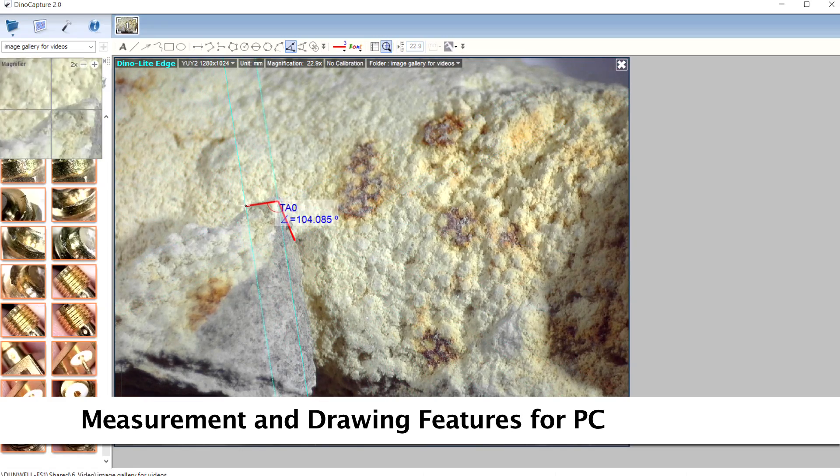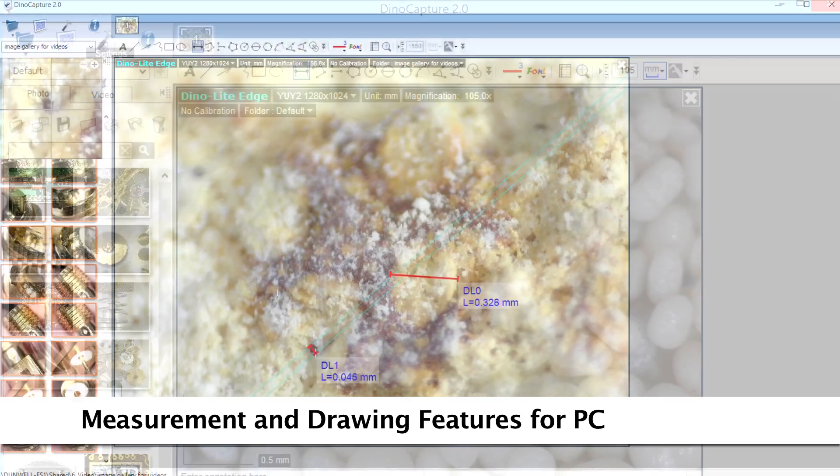The included software has measurement for compatible measurement models, as well as drawing and annotation tools.